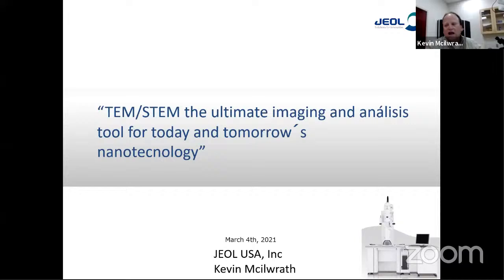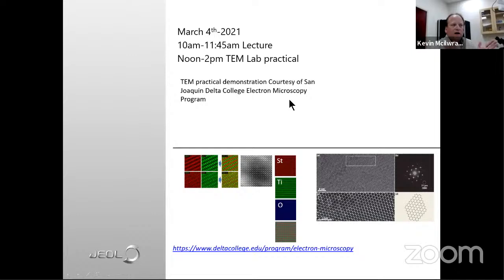I wanted to cover a really broad range of applications and topics about TEM, from a historical perspective to what's currently going on and some future stuff, and give you an idea of how we align these things. And some of the imaging techniques we'll also try to do in the lab portion. Now, I'm on a 120 kV LaB6. It's not an analytical tool. There's no EDS detector. It's just an imaging tool, and it's a teaching tool where I'm at. So now we will have the lecture, about an hour and a half.